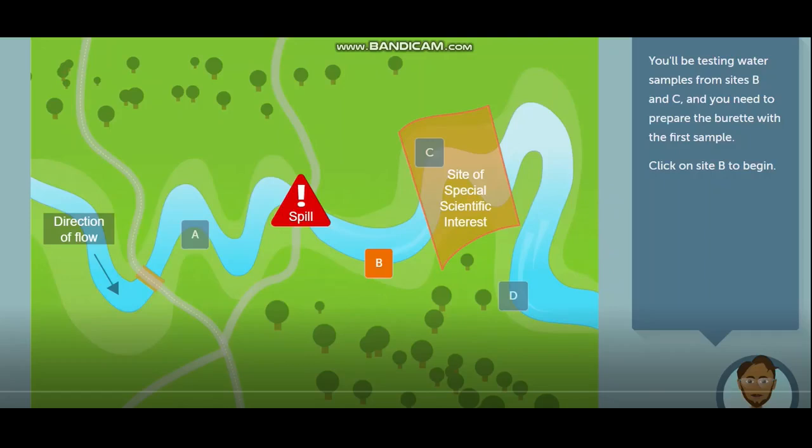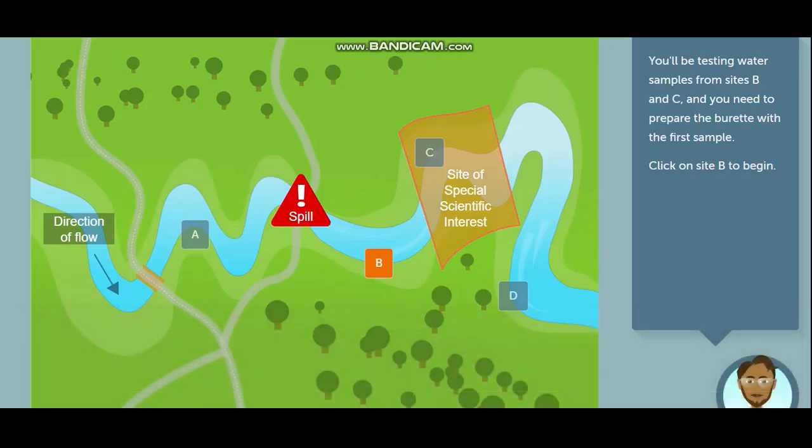When you now titrate, after titrating, you will read out the volume from the burette. So after titrating, you now have two volumes, one from the pipette and one from the burette. You can now use them to find the unknown concentration of the solution you are working on.